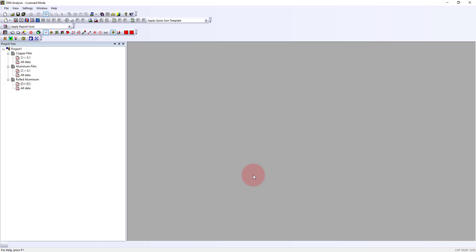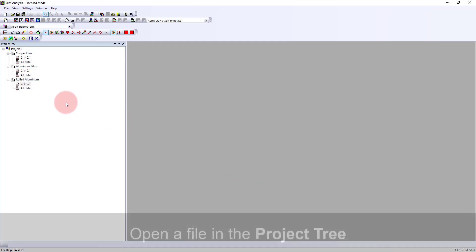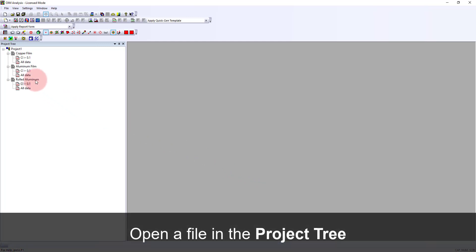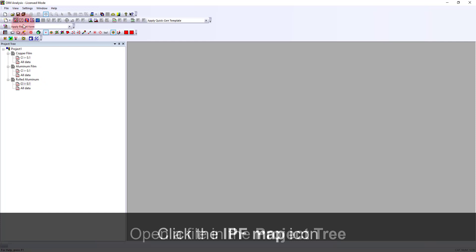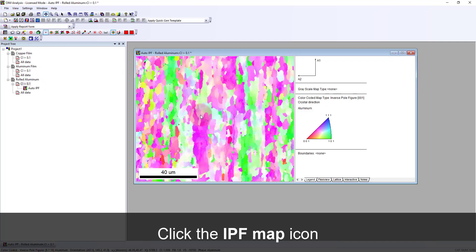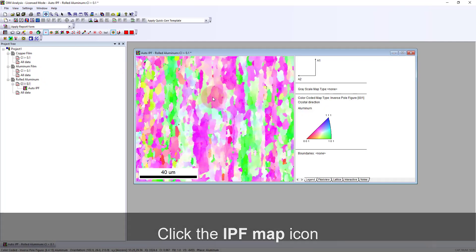Hello, today I want to show how we can use OIM analysis to look at the texture or the preferred orientation of different materials. To start, I've loaded three different datasets. I'm going to start with a file from a rolled aluminum sample and create an IPF inverse pole figure orientation map, where each pixel is colored according to this stereographic triangle to show the orientation relative to the surface normal direction.